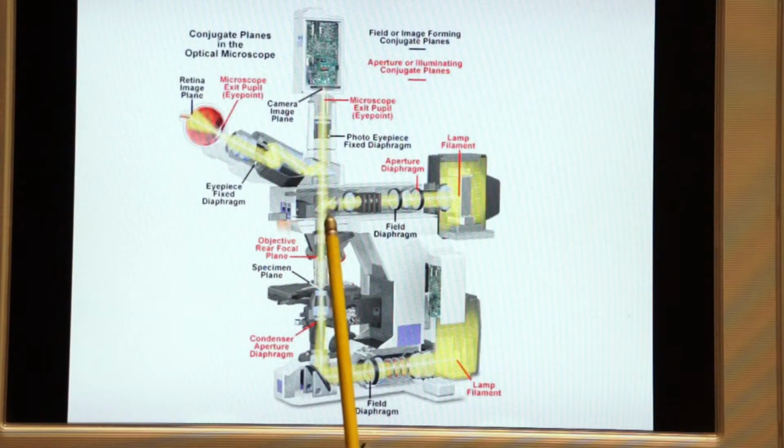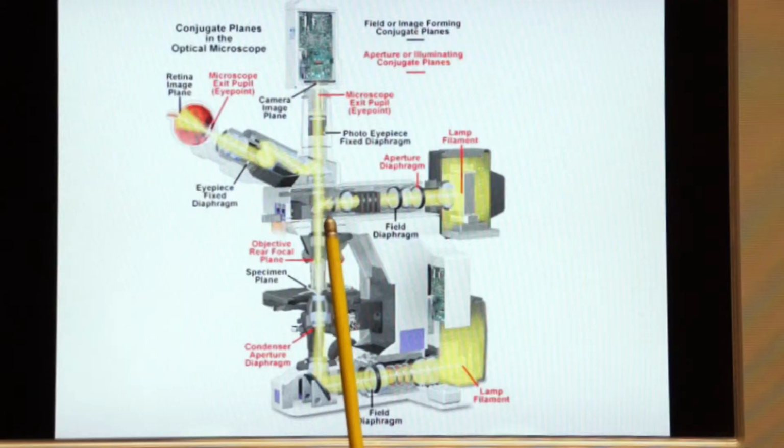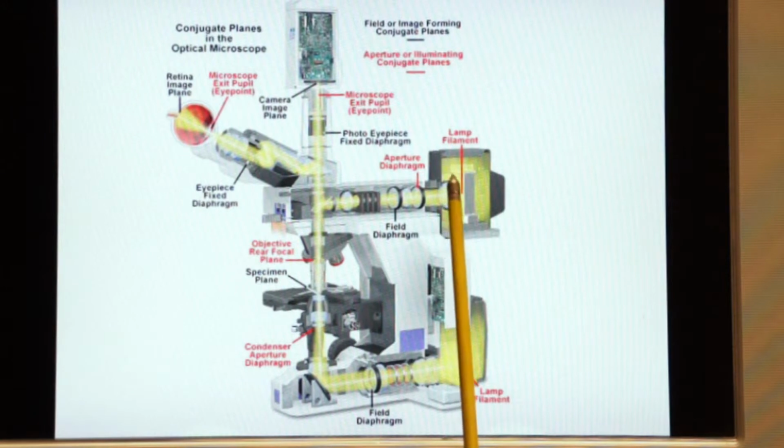Now this microscope also does reflected light. Remember, in fluorescence we're using reflected light to illuminate our specimen. So this is the fluorescent vertical illuminator. Here we have the lamp housing, which has that mercury bulb that we're going to discuss more in a few minutes. It produces a lot of light which travels through the vertical illuminator.